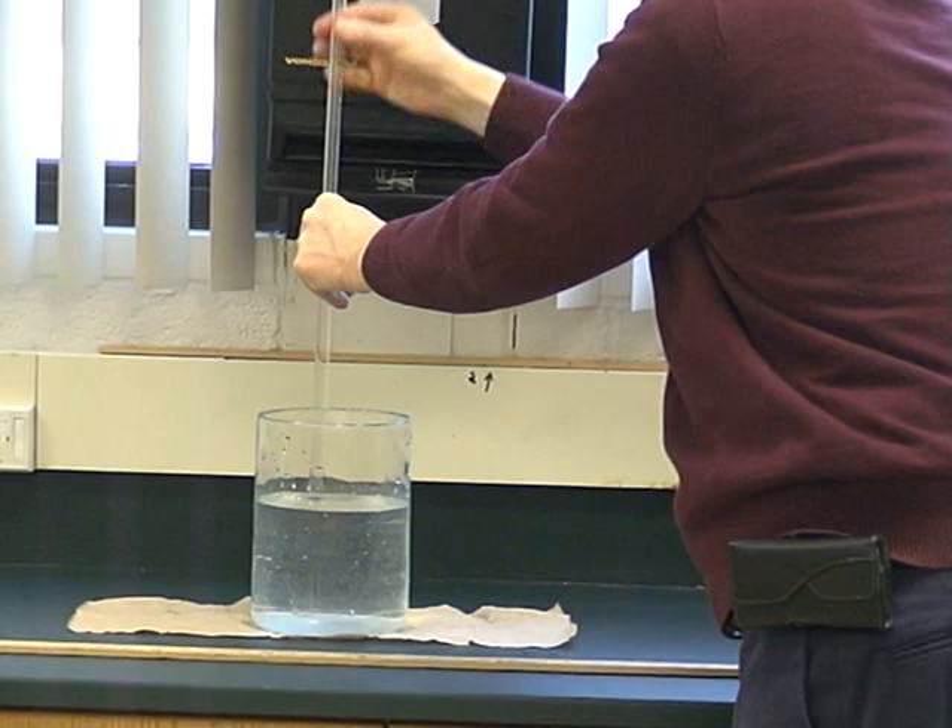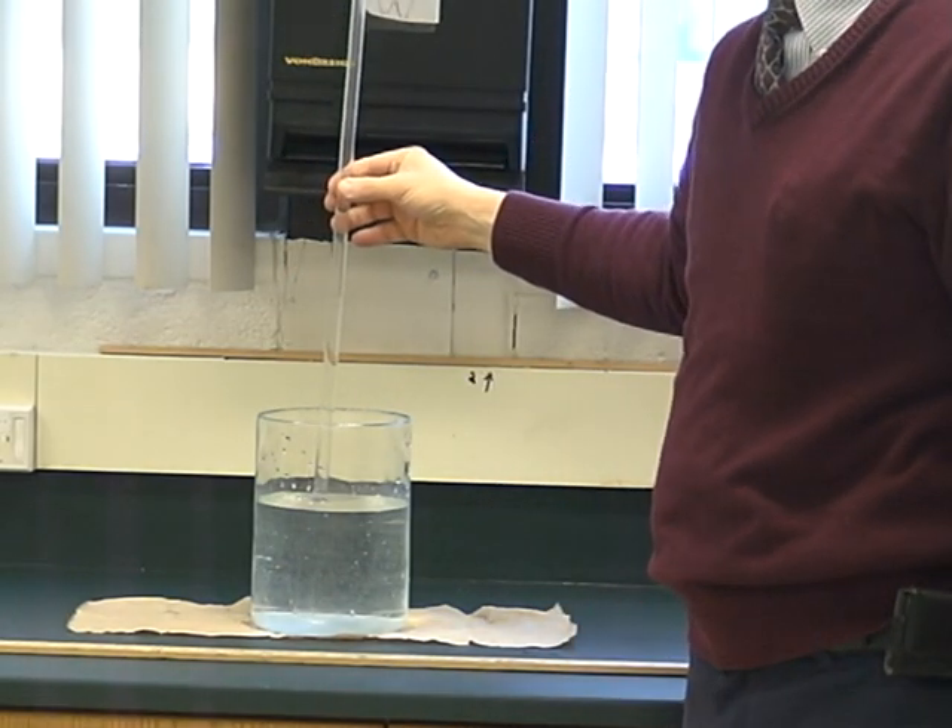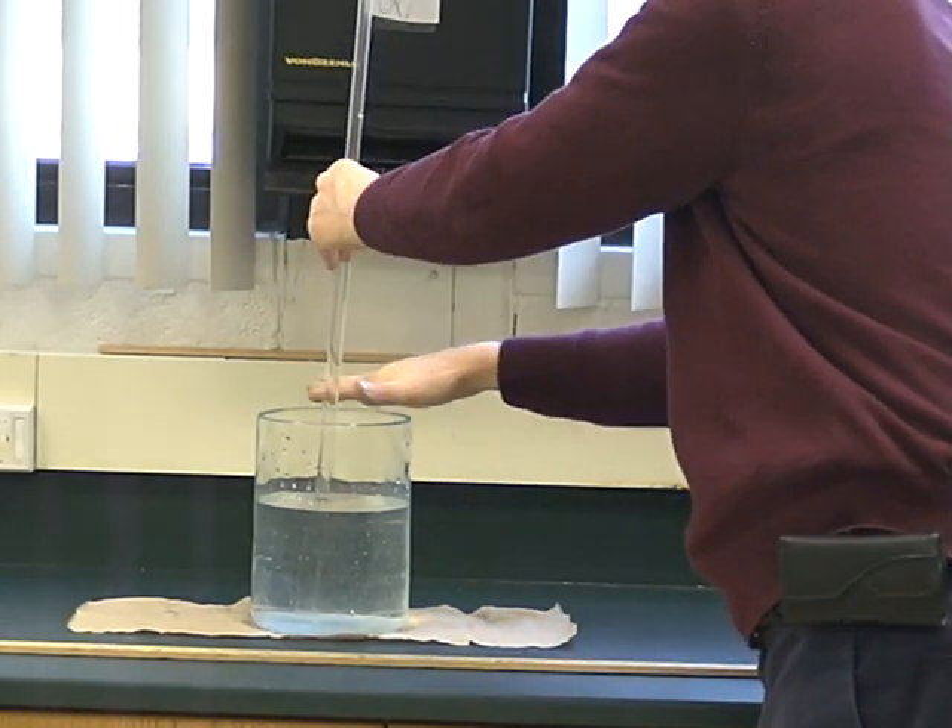That means there's a gas pressure in here — there's air inside that tube. And there's also atmospheric pressure pushing down on this water here.